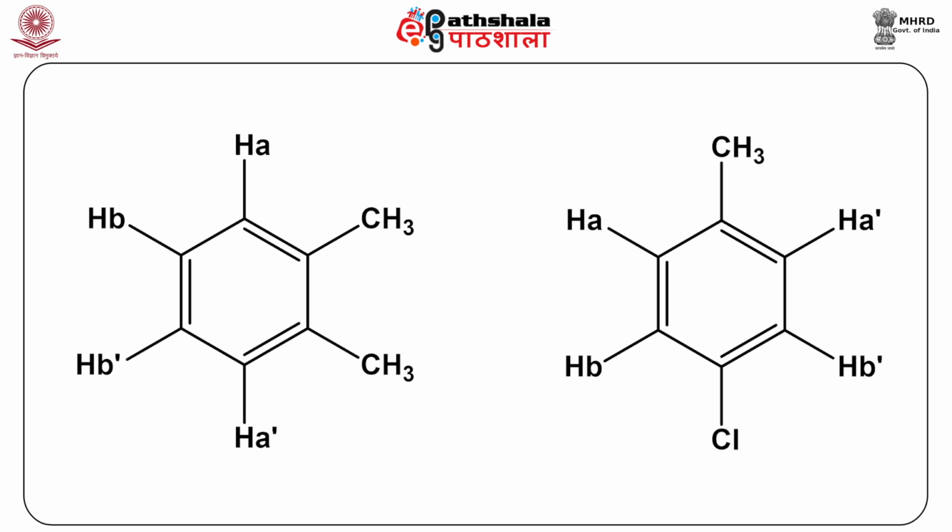Thus, the proton being observed has different coupling constants due to the two chemically equivalent protons, that is HB. Hence, both HA protons are not magnetically equivalent. Similarly, both the HB protons are chemically equivalent but magnetically inequivalent due to their different coupling relationships with both HA protons.